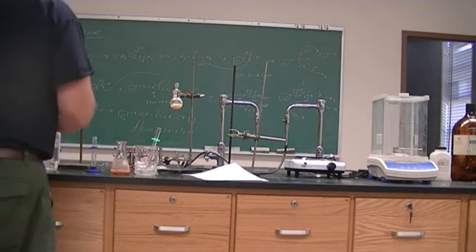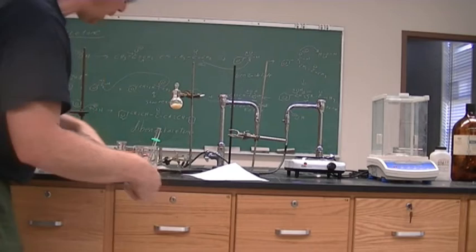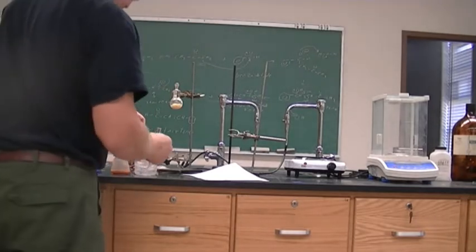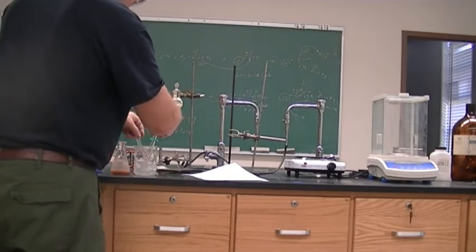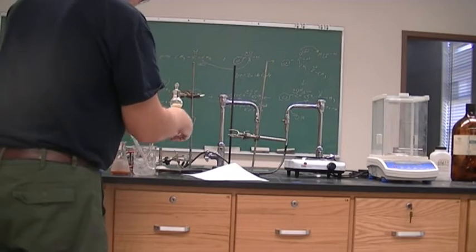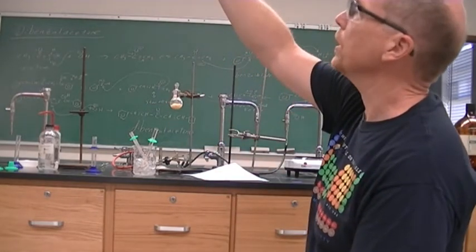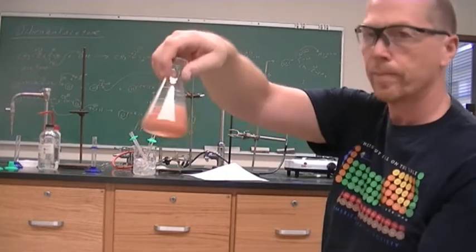Alright. So when you wash it, you want to wash it with cold ethanol so it doesn't dissolve our solid. We're also going to clean it with a little bit of water as well. So I want them to be cold so it does not dissolve our product. I want to get as high a yield as possible. Right, so we have again, a good amount of solid. The reaction worked just like it was supposed to.